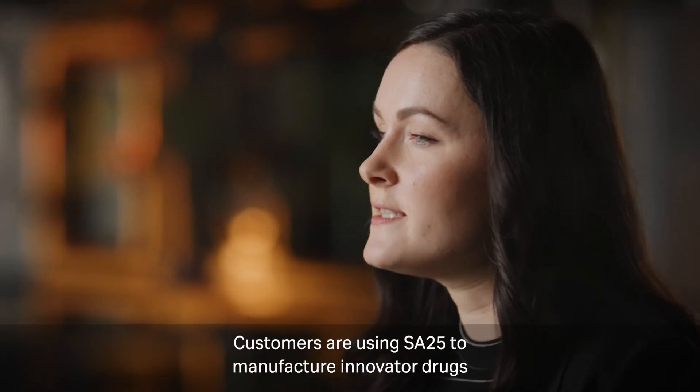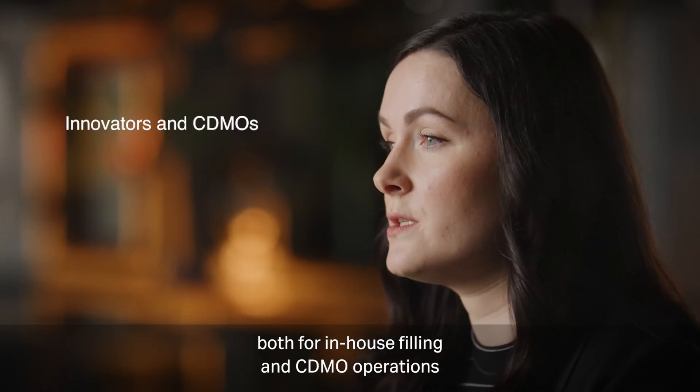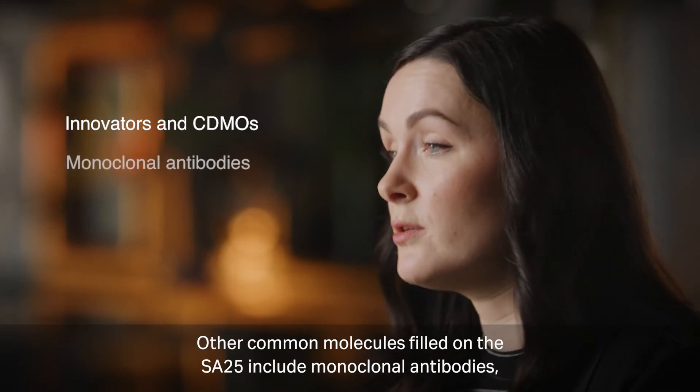Customers are using the SA25 to manufacture innovator drugs, both for in-house filling and CDMO operations. Other common molecules filled on the SA25 include monoclonal antibodies, mRNA, gene therapies and potent compounds.